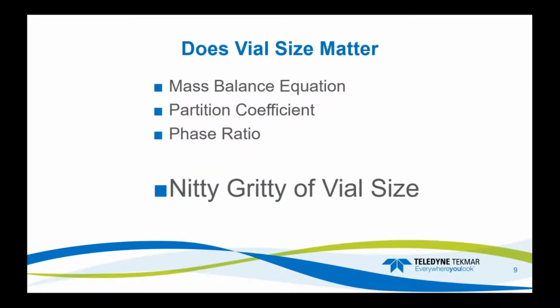Okay, so does vial size matter? What we're going to look at is the mass balance equation, partition coefficient, and then the phase ratio. Then we'll get down to the nitty-gritty of vial size and look at some real data.